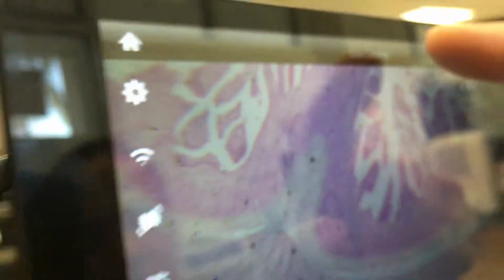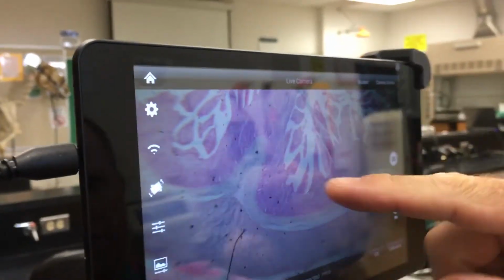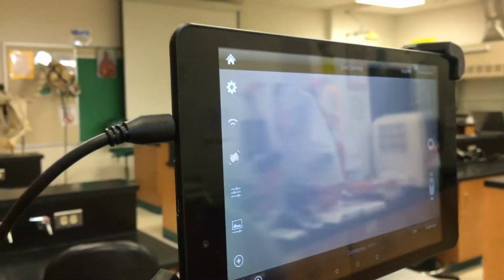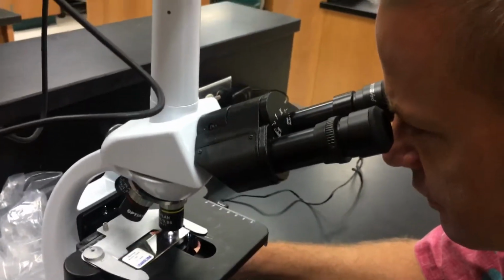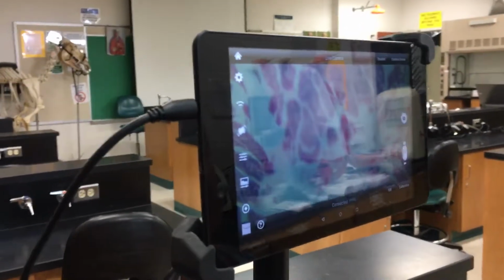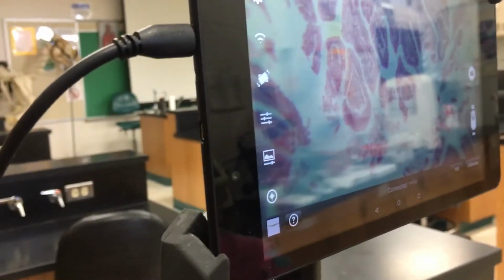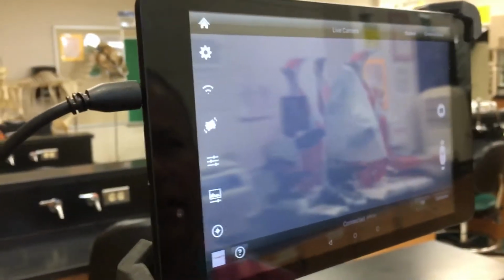We'll look in there. So right now, you know that it's epithelial because there's an opening somewhere. Oh yeah, so there's a digestive tract. There's an opening. It has to be covered with epithelium. So let's look in there first. The scope is way out of focus with the camera. Okay. I notice you have to toy with it every time you switch lenses. Yeah. Okay, so this is epithelial tissue in here, next to that opening. I'm going to move up one more lens and let it think for a second.